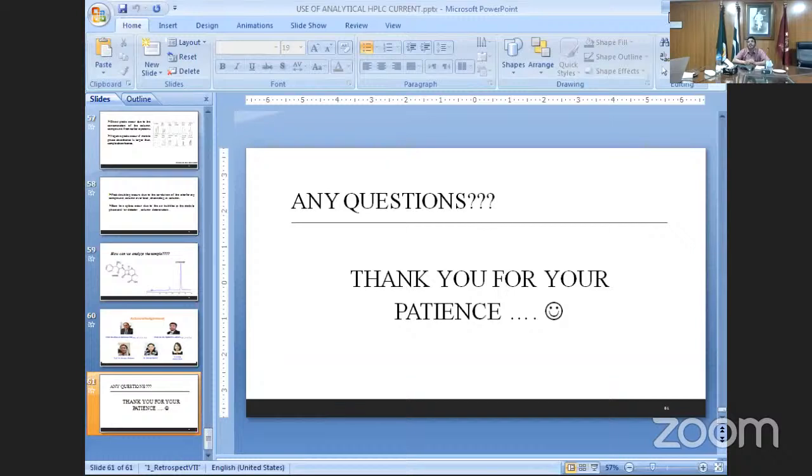So in this presentation, we are going to demonstrate what HPLC is. One by one, we are going to explain the parts, and explain how to make methods. But now we are studying the HPLC with the parts which we mentioned yesterday in our presentation.